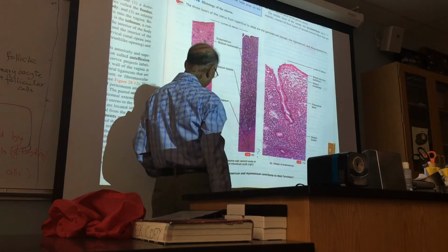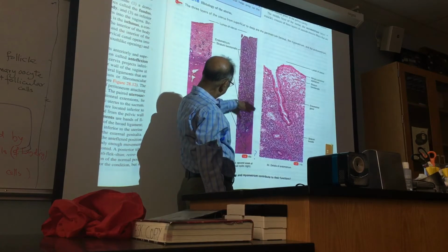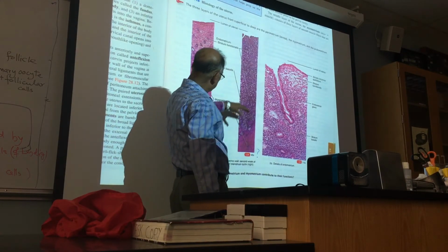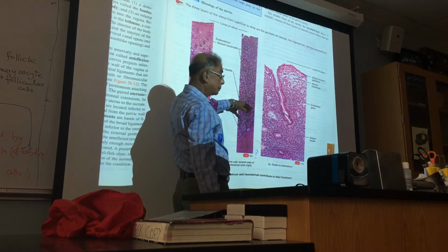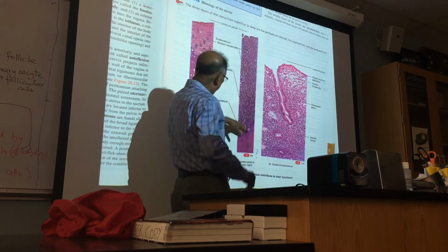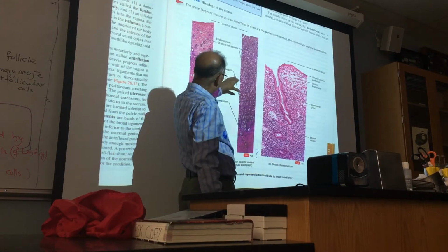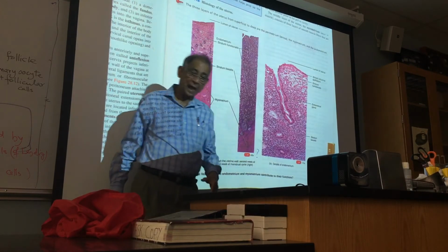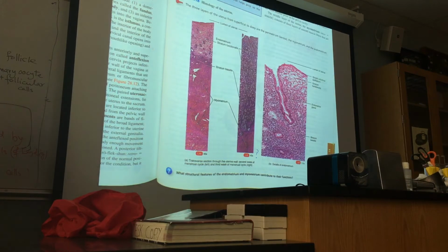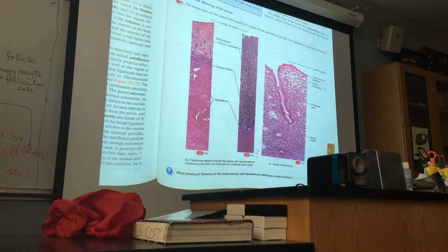So the functional layer, stratum functionalis, is sloughed off during the menstrual period, and then a new functional layer forms on top of the stratum basalis with the action of several hormones, especially estrogens and then progesterone. You will learn about that in the lecture, the materials for your third lecture exam very soon.